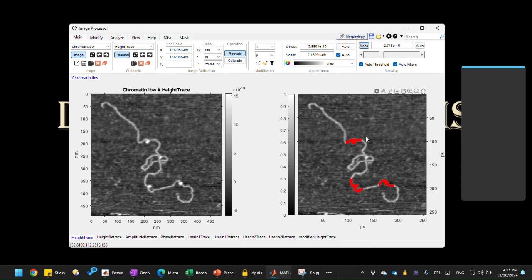Now you see, it masks all three protein DNA complexes within a custom specified box. So in this way, we don't have to mask the whole DNA. We don't have to manually repeat this process to mask individual protein complexes. It allows us to automate this process.